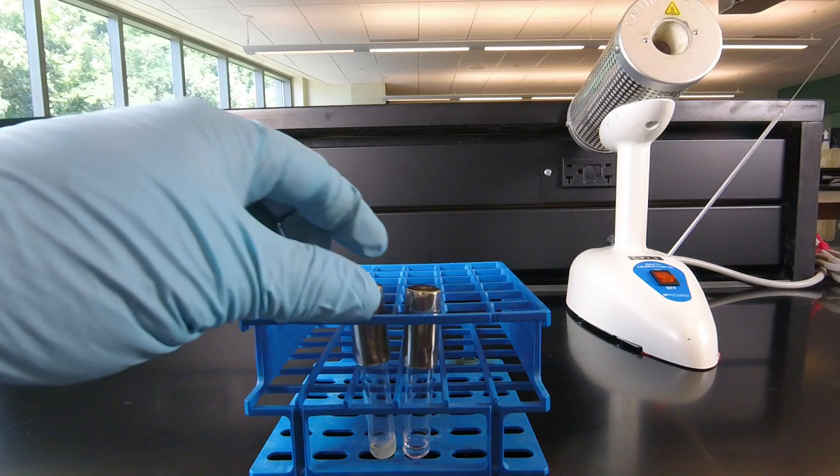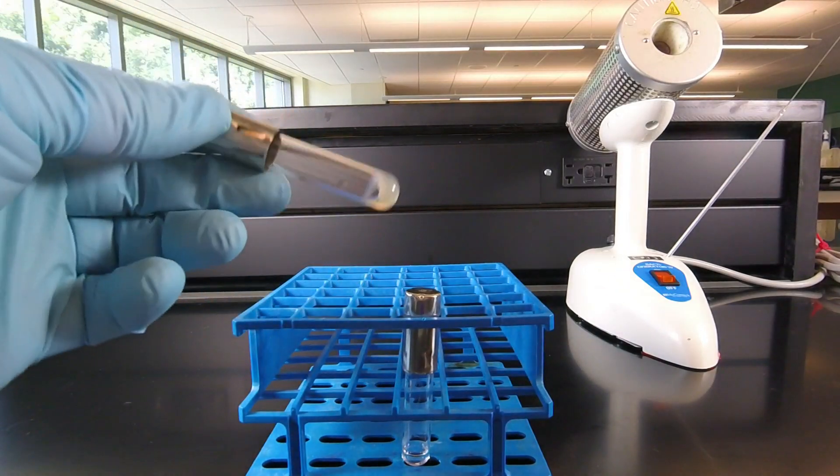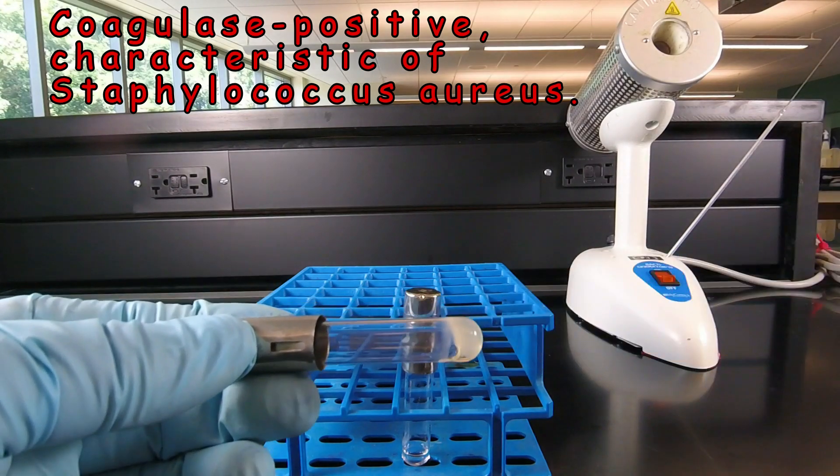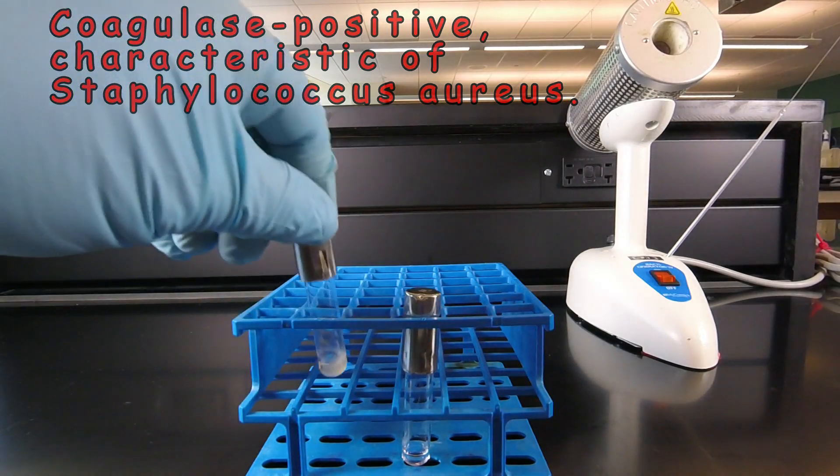This is a tube of citrated rabbit plasma that was inoculated and incubated. This is a coagulase positive bacterium. We'll see that the rabbit plasma at the bottom has gelled. So that would be coagulase positive.